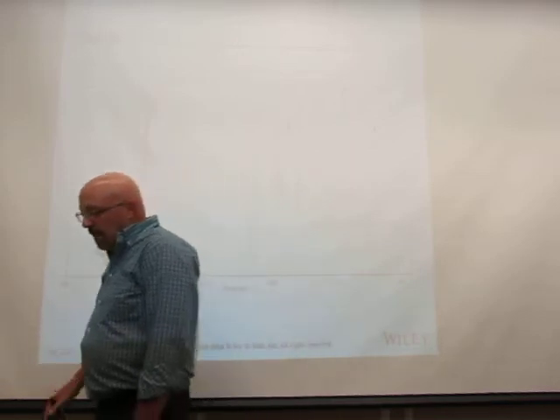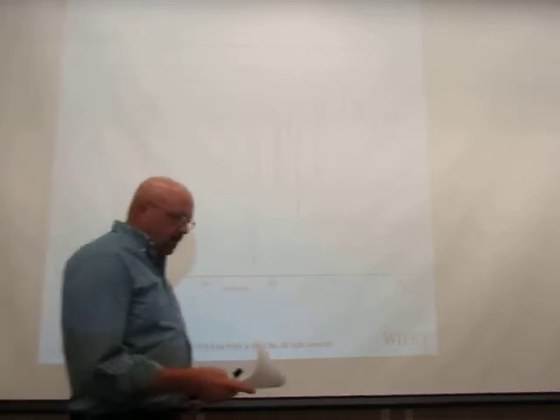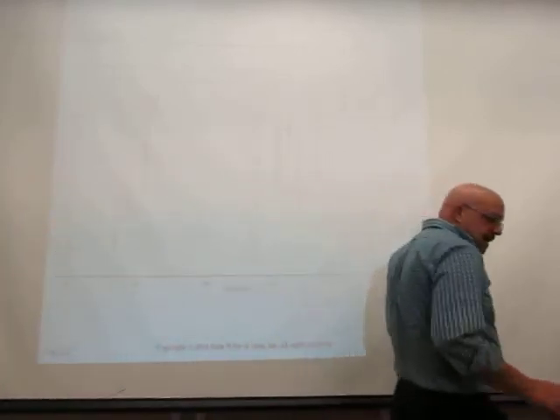The other thing that the amide has, of course, is a carbonyl, so we will see the C double bond O stretch, and that's in the normal range of most carbonyls, maybe a little bit on the lower side, about 1630 to 1690 reciprocal centimeters, and of course always strong in intensity. All carbonyls are strong. So let's look at some examples here of the amides.